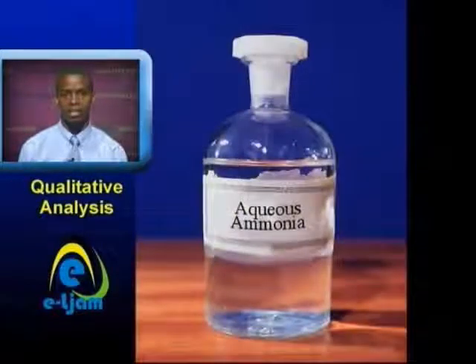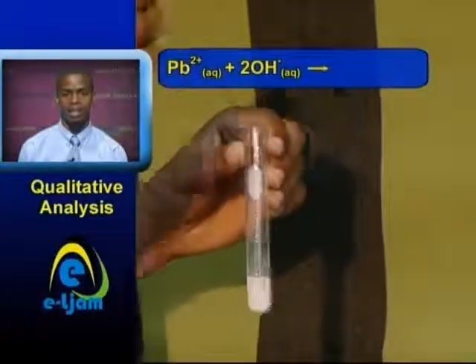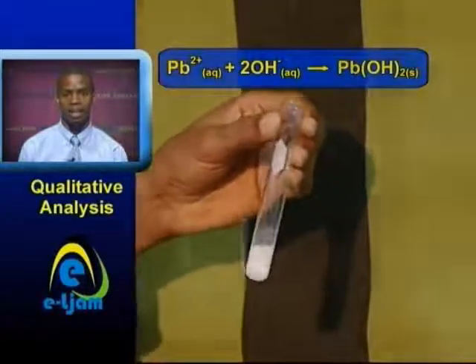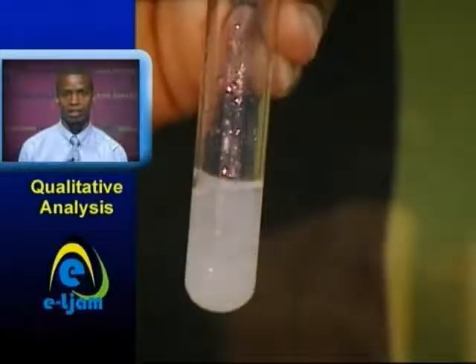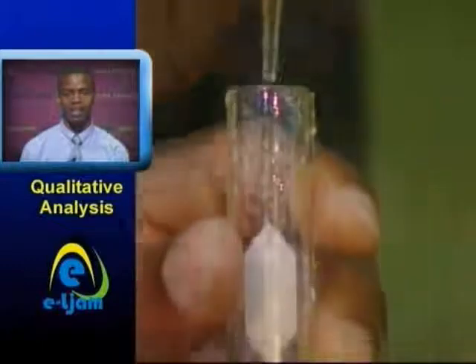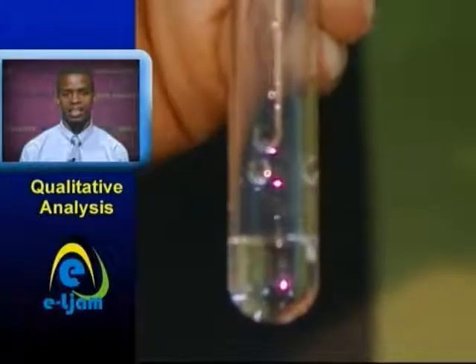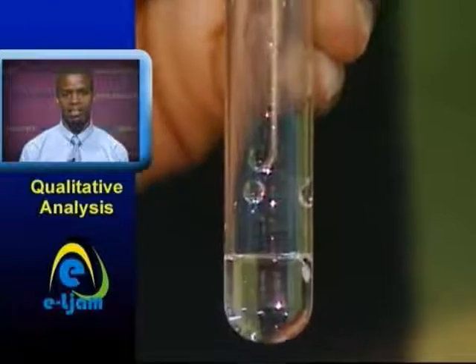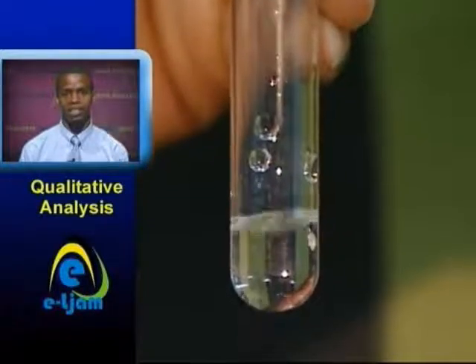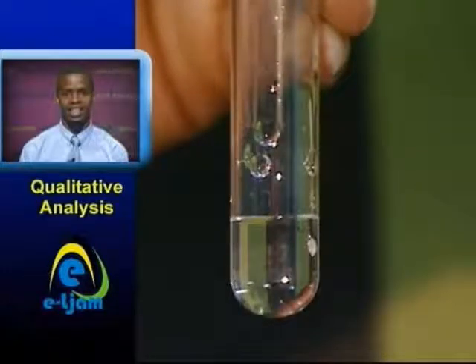The metal hydroxides formed with aqueous ammonia are insoluble in excess except copper and zinc hydroxides, which dissolve in excess aqueous ammonia as soluble complex ions are formed. Aqueous ammonia will not precipitate calcium ions. Calcium hydroxide only precipitates when the concentration of hydroxide ions in solution is relatively high. As ammonia is a weak alkali, it has a relatively small amount of hydroxide ions in solution when compared to strong alkalis.